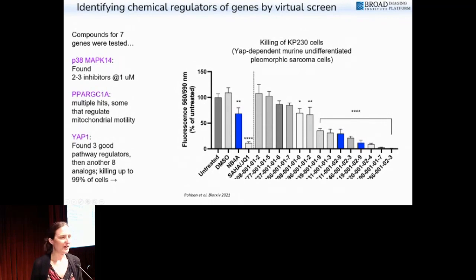And out of those 7, again, roughly 30 to 40% of the time, it worked. In fact, in 5 of the cases total, they had some promising results. 2 of them, the chemistry was bad. I'll spare you the details. But 3 of them convincingly worked, where we found inhibitors of particular pathways that were interesting. The one that's most interesting is shown at the bottom.